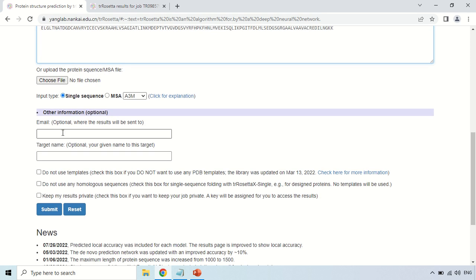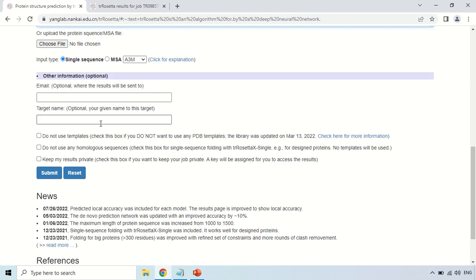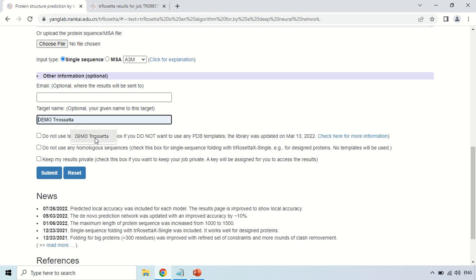Email is optional, but I recommend you give your email here because it takes time to generate the result — it may take one to two hours or more. You have two options: either wait on this page, or give your email and the tool will send you a link to the results when they are generated. It is a good decision to paste your email here. For the target name, write the name of your protein or whatever name you want to give. For example, I am giving the name 'DEMO Trrossetta,' then click the submit button.